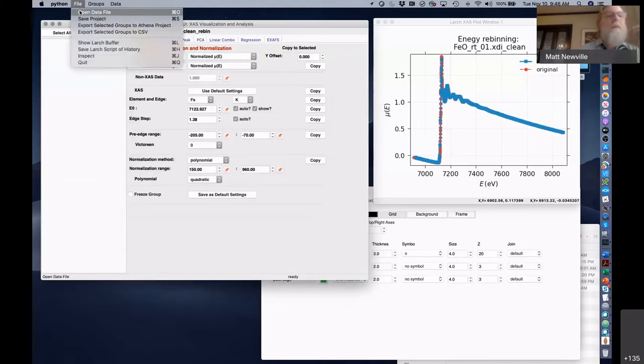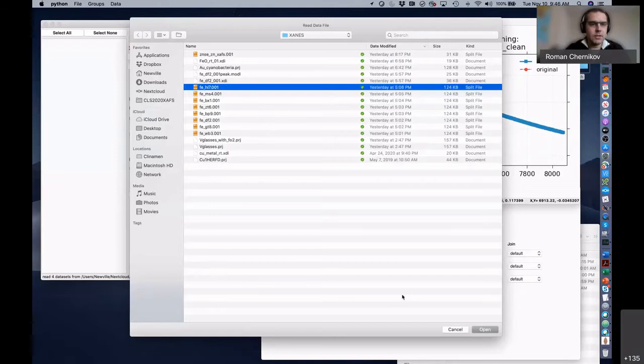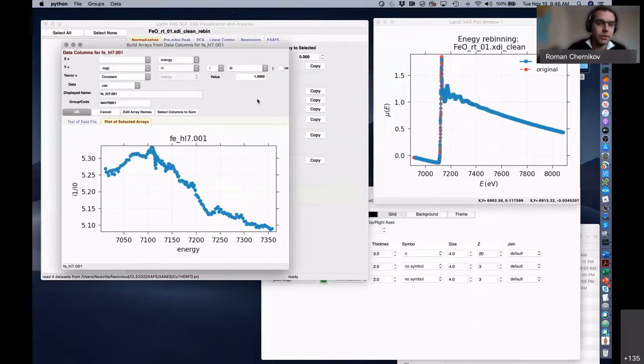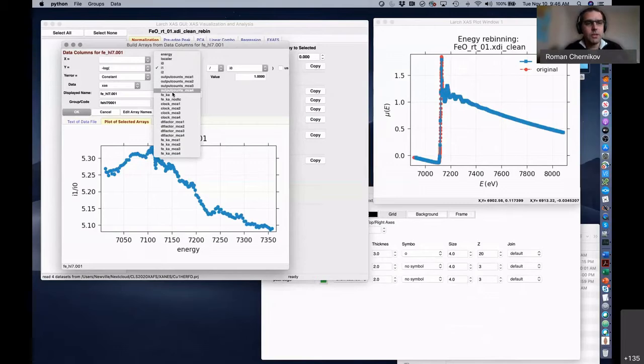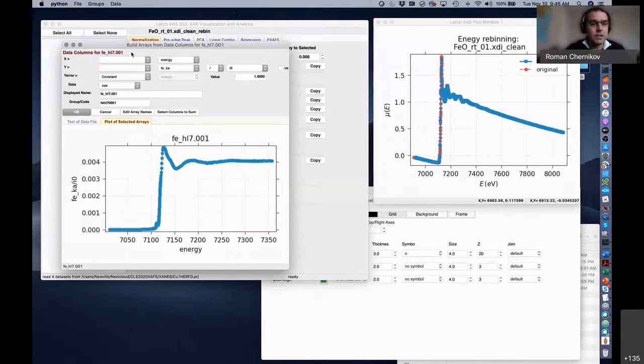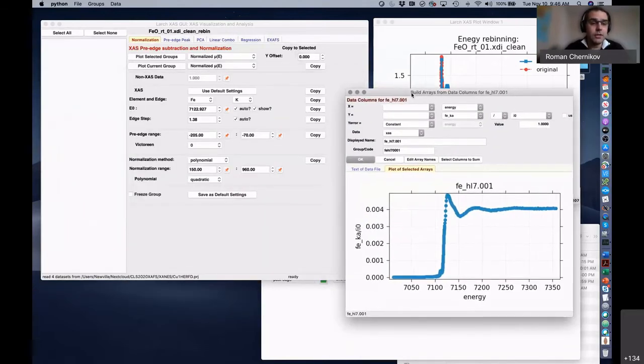It's pretty specific. Okay. There's a measured spectrum on arsenate, on distorted arsenate, and it's supposed to be a distorted structure with a high Debye-Waller factor, and the height of the peak is supposed to be lower than on references. Why could it be that the height of the peak is as high as on an undistorted material? Or I can generalize this.